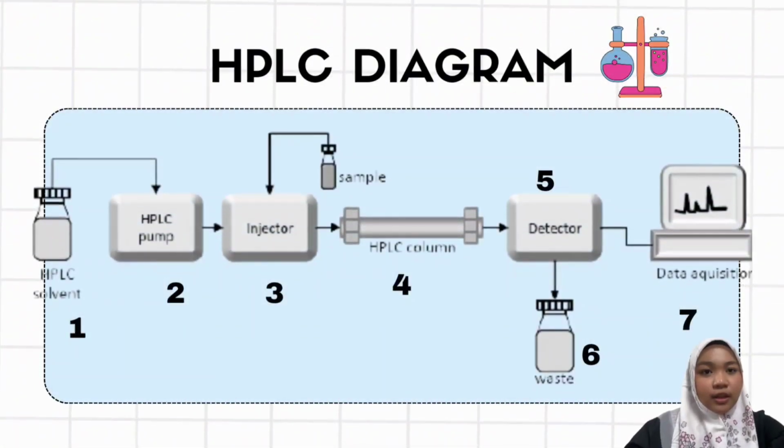This is an HPLC diagram, and each component has its own function.